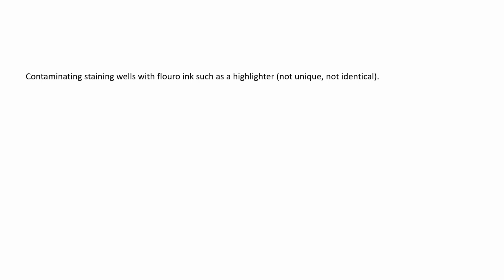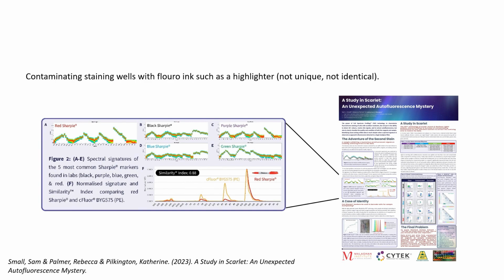It is even possible to alter the signature of your reference by accidentally getting some small amount of ink into your sample. So be wary of how you mark your wells.